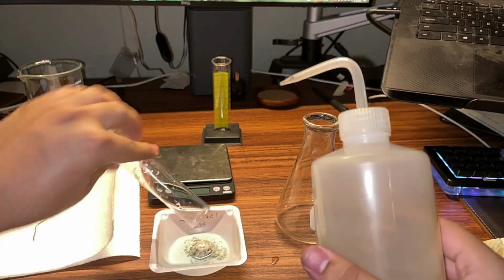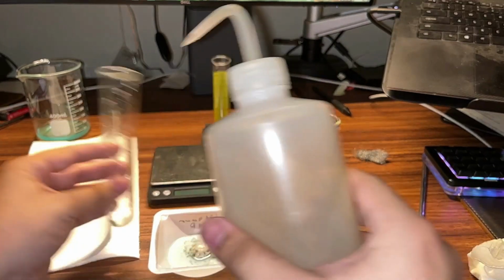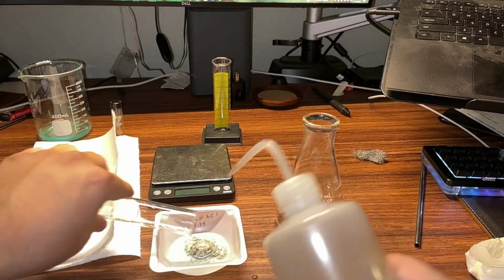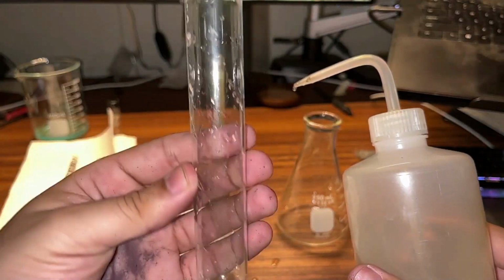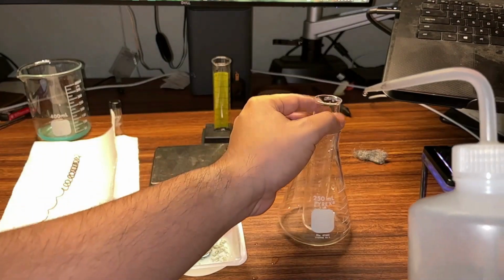There we go. Do another rinse. I don't want to use too much water because I don't want to fill my weigh boat up with water. But there we go. I think I got all of the silver out of my test tube there, which is what I want, right? All my silver to end up in my weigh boat.